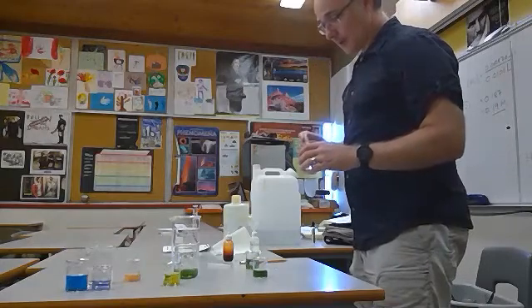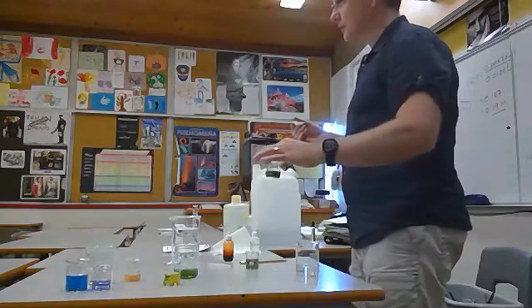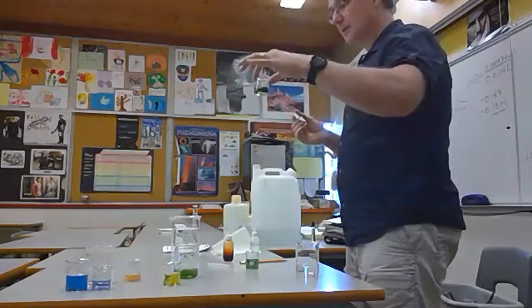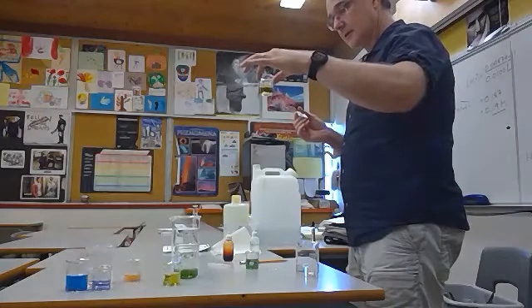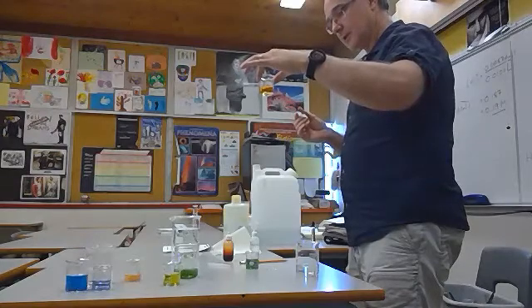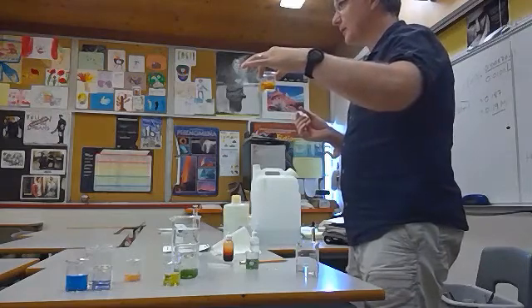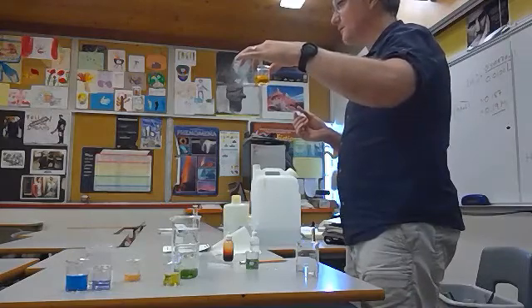So if I plop this into the water solution with the universal indicator, I'm just going to add a single drop. There's just one drop in there. Let's give it time. It's going yellow. It's going orangey. And I think the orange is around pH 2 or 3. Okay, so a single drop of acid went from pH 7 to pH, let's say 2.